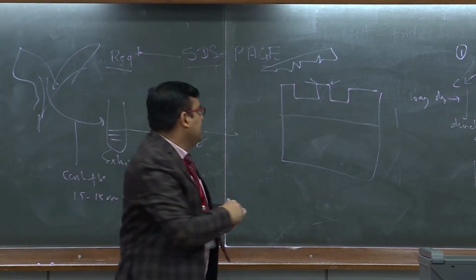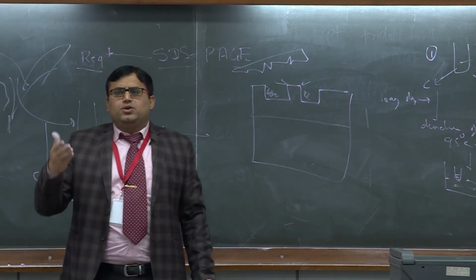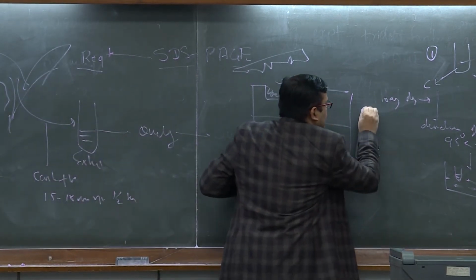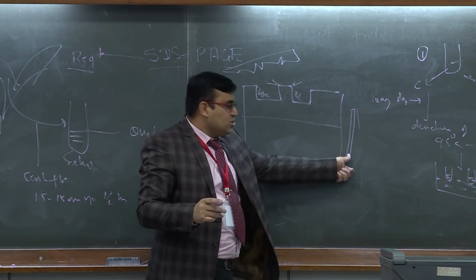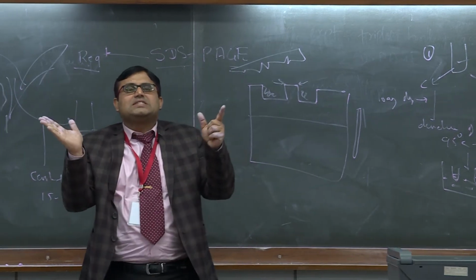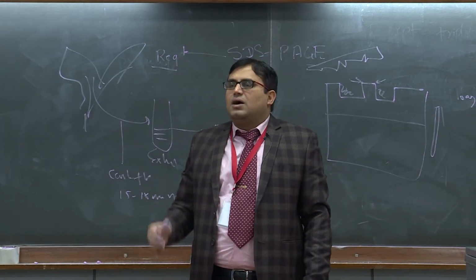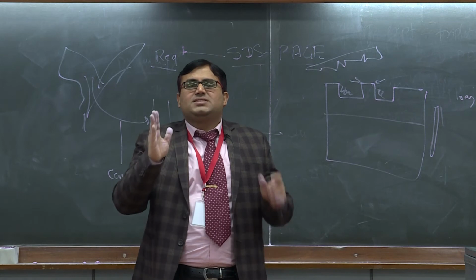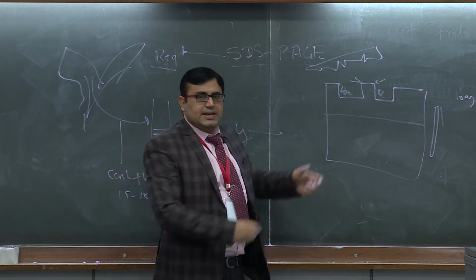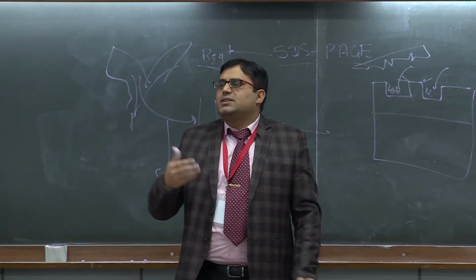Second thing, many times when you remove a comb, some remnant will be there. So in your lab, Whatman paper is there, right? Make a thin strip of Whatman paper, cut using scissors, then put the Whatman inside and in one go take it out. All these remnants will stick onto the functional groups of Whatman and come out in one go. I mean to say, the well should be neat, clean and straight. Then only you will get the best quality results. Once your well is clean, load the sample, put the unit into the running tray and run it.